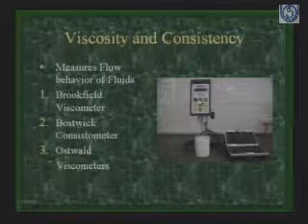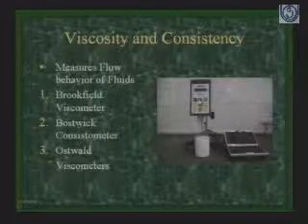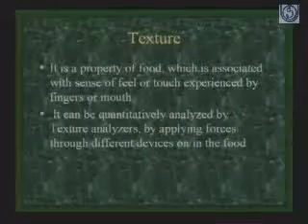of the viscosity. I repeat again, viscosity as such, low or high, doesn't indicate the quality of a product, but a definite range of viscosity is required to judge the quality of the product. Like gum should have a very high viscosity, the milk juice should have a low viscosity, or the milk product should have a low viscosity, something like that. So we can measure the viscosity and consistency of the products.